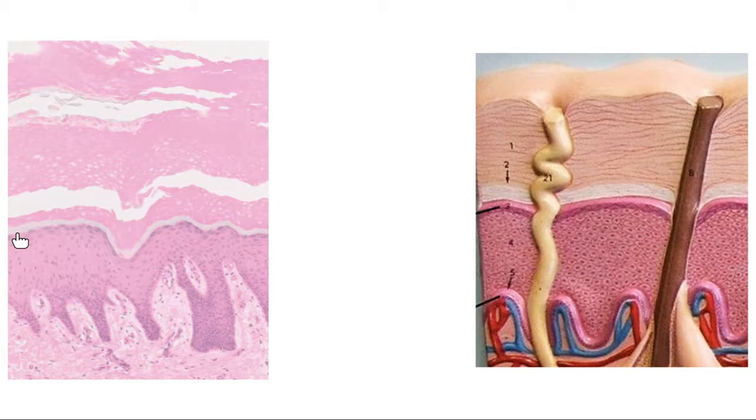We haven't talked a lot about this, but I'll mention, in case you haven't found it yet, in the student Google Drive, there are a bunch of folders that have tissue. It's called Tissue Images from Our Slides. There's a whole PowerPoint presentation that's filled with pictures of the skin.